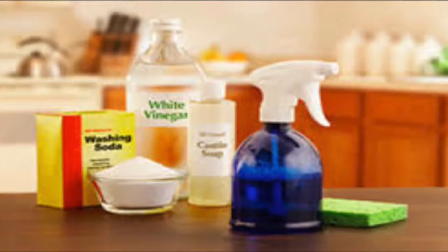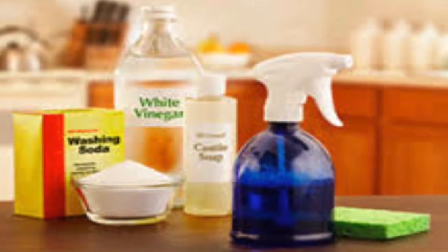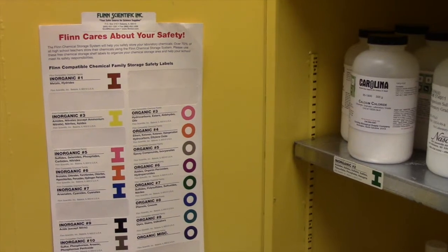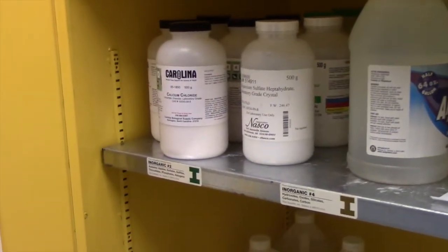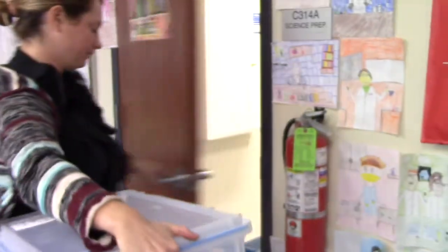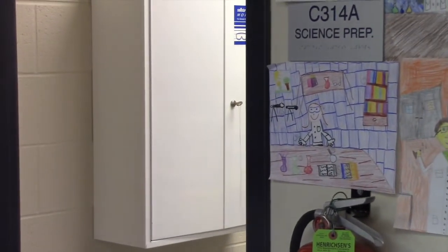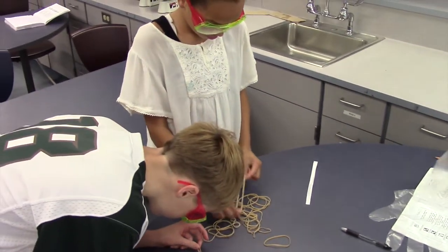You will find that most kindergarten through 6th grade science activity procedures call for household chemicals. Before using these, study the product label carefully to learn the hazards and warnings. Always store chemicals and solutions in properly labeled containers meant for holding chemicals and solutions. Never store chemicals in containers that were originally used for food. Always wear high-impact safety goggles when working with flying objects such as rubber bands.